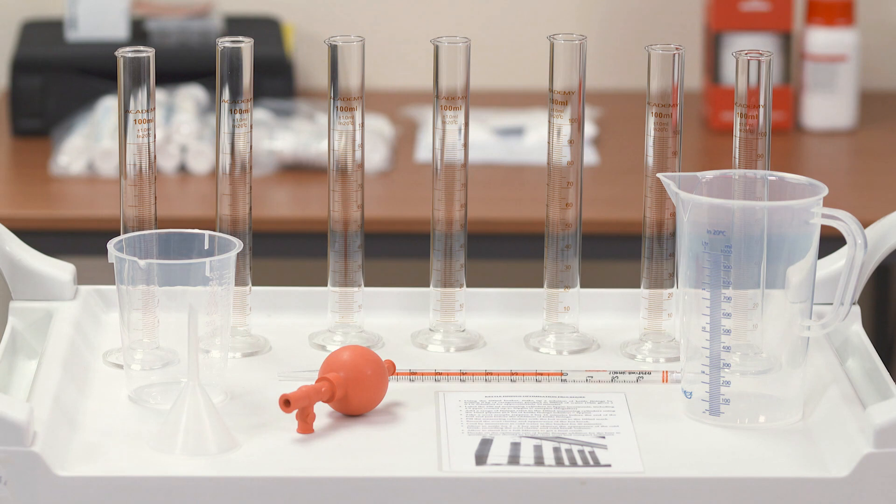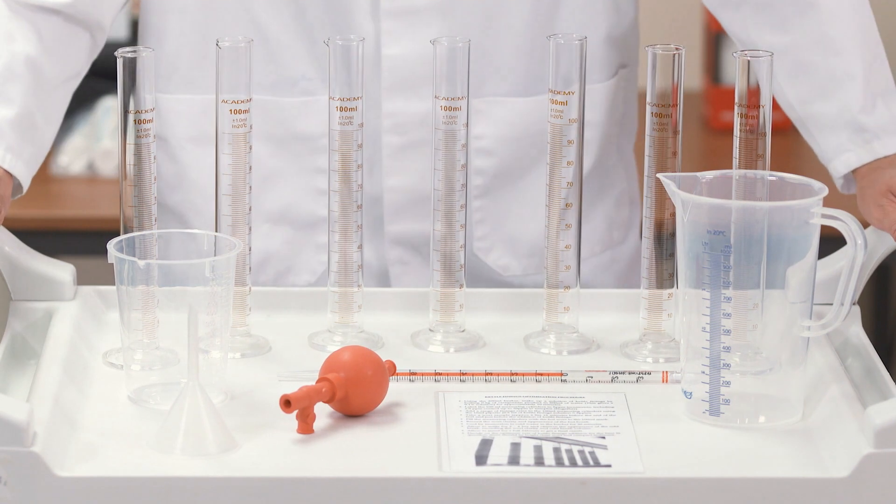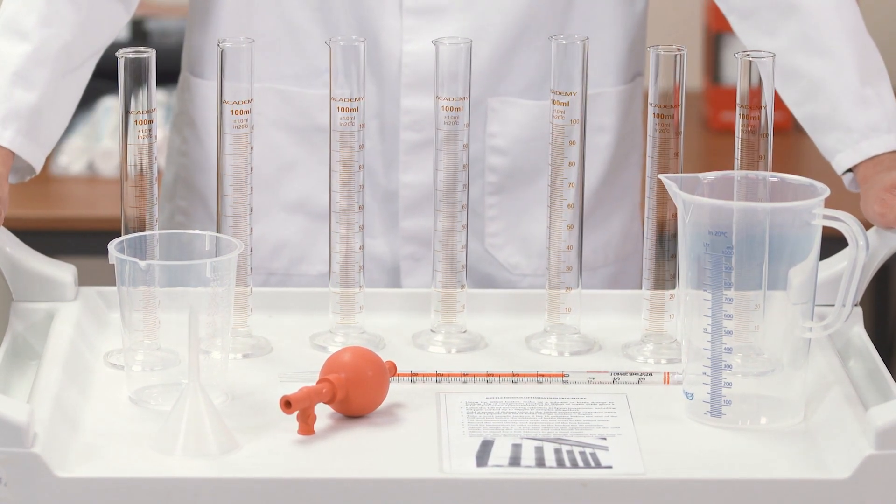By using our copper finings optimisation testing kit, you can make sure that you're using the optimum amount for your beer. In the kit you'll find everything you need to do the test.